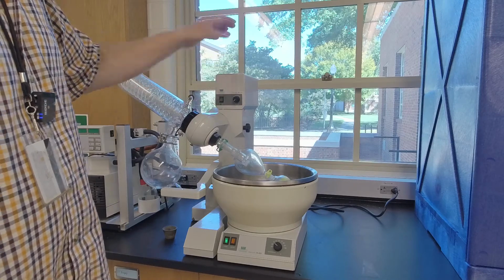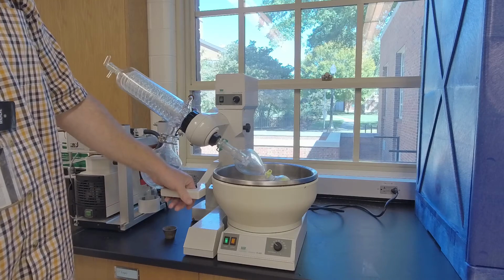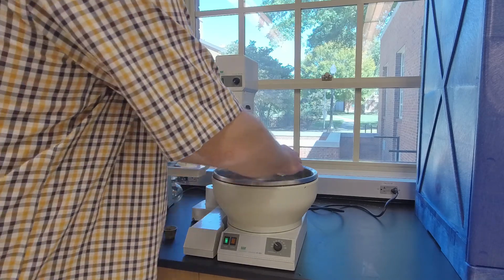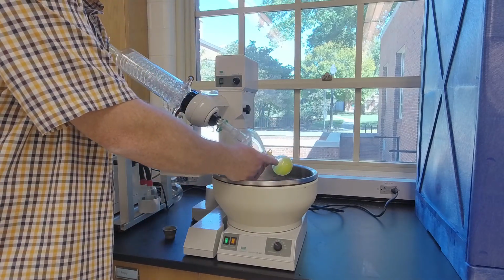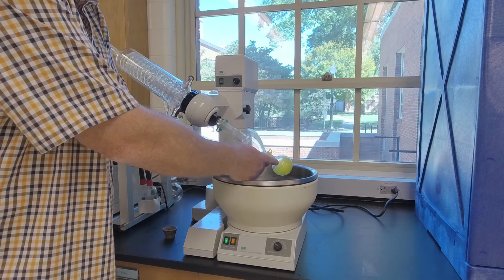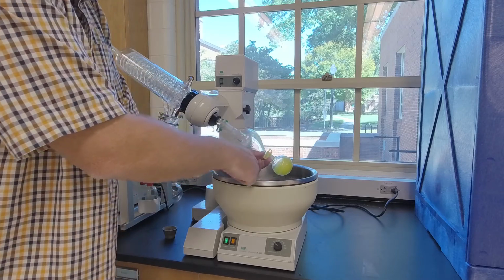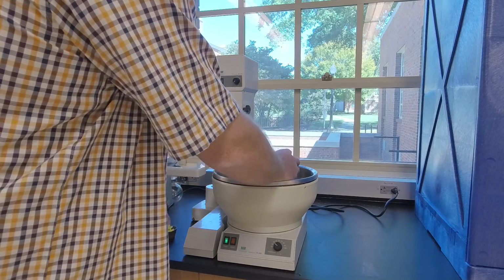Now, the next thing is stop the spinning. You can turn that off. You'll see this when you come in, there's a little lever here so we can lift this up. Hold on to the flask. This is your valuable product. You've worked all day, or maybe you've worked for 6 months to make this yellow stuff. Pull this keck clip off, not holding on to it, and it falls into the water, and you start all over. All right, so pull the keck clip off.